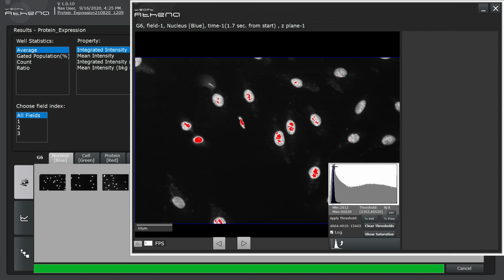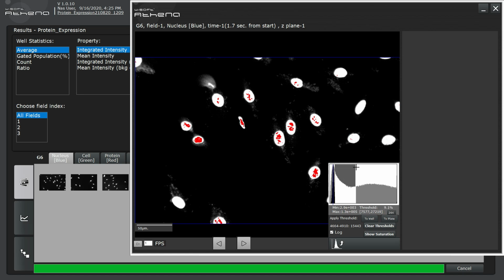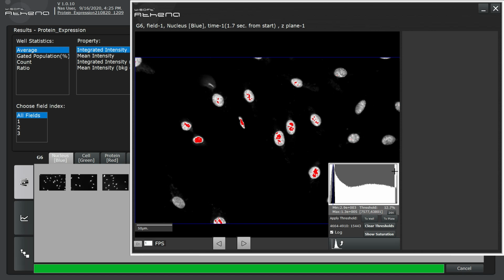One way to set contrast range is by placing the lower bound to correspond to an area of background, which should appear black, and drag the contrast range upward until we see all the details we're interested in visualizing. Alternatively, we can click in an area we want to appear white, then drag downward to determine what should be hidden in the background.